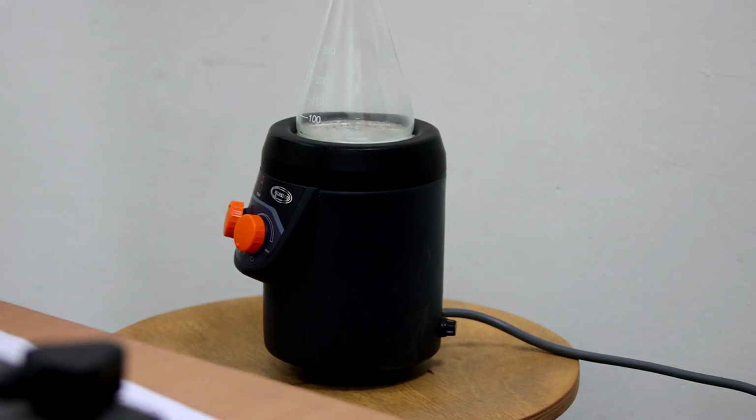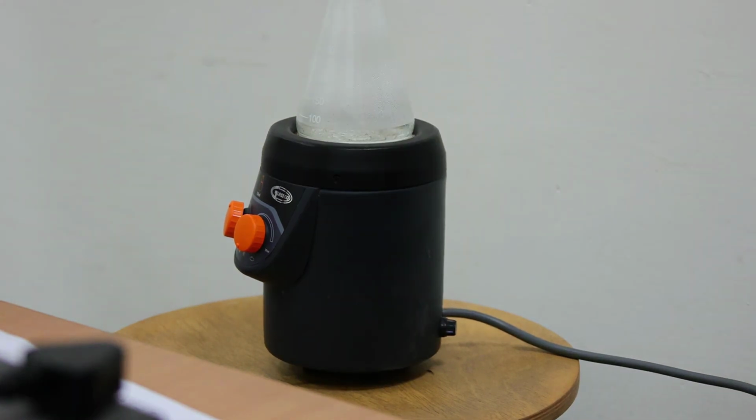So how do we know? We will start seeing vapor formation at the top of the conical flask, and one or two bubbles may come from the bottom. At that point, we should stop heating. So now you can see that the upper portion of the conical flask has some vapor of water, and one or two bubbles are starting to come at the bottom of this solution. So we should remove it from the heating and then go for titration.